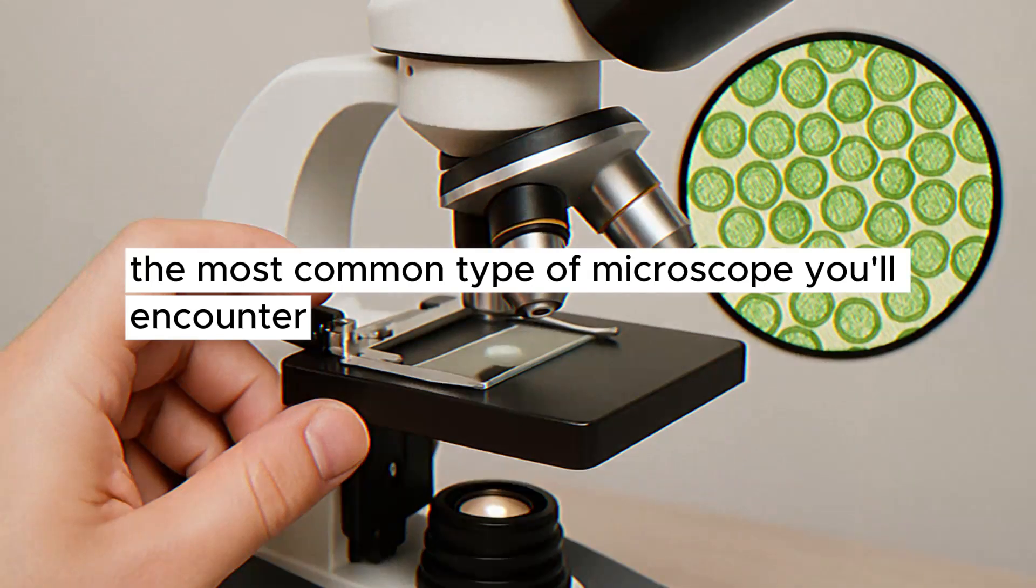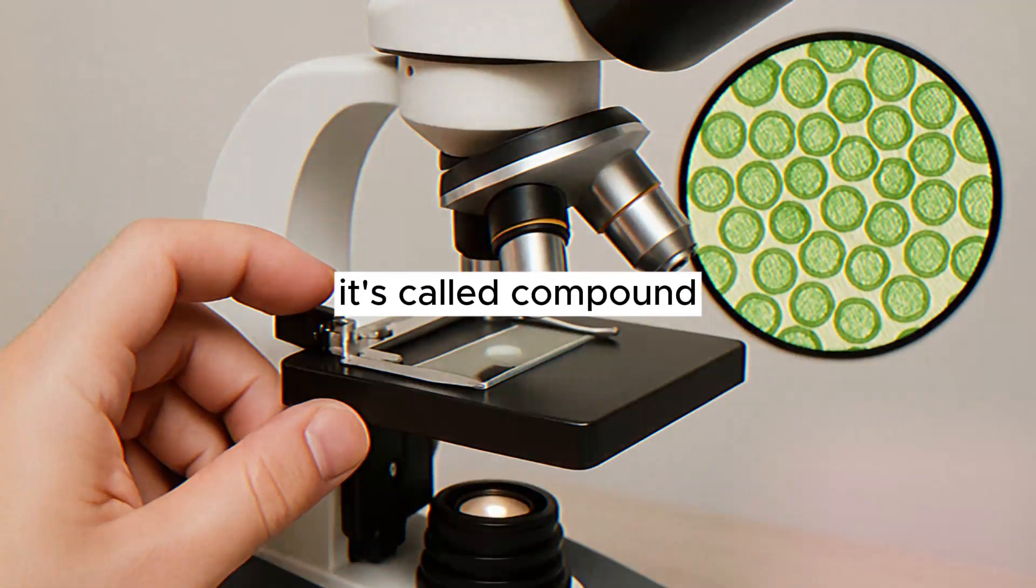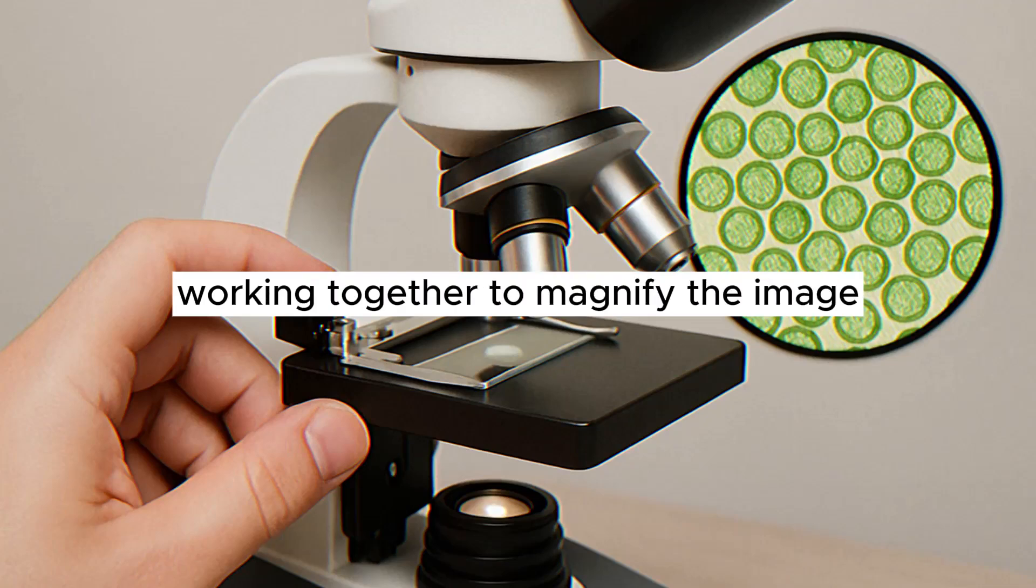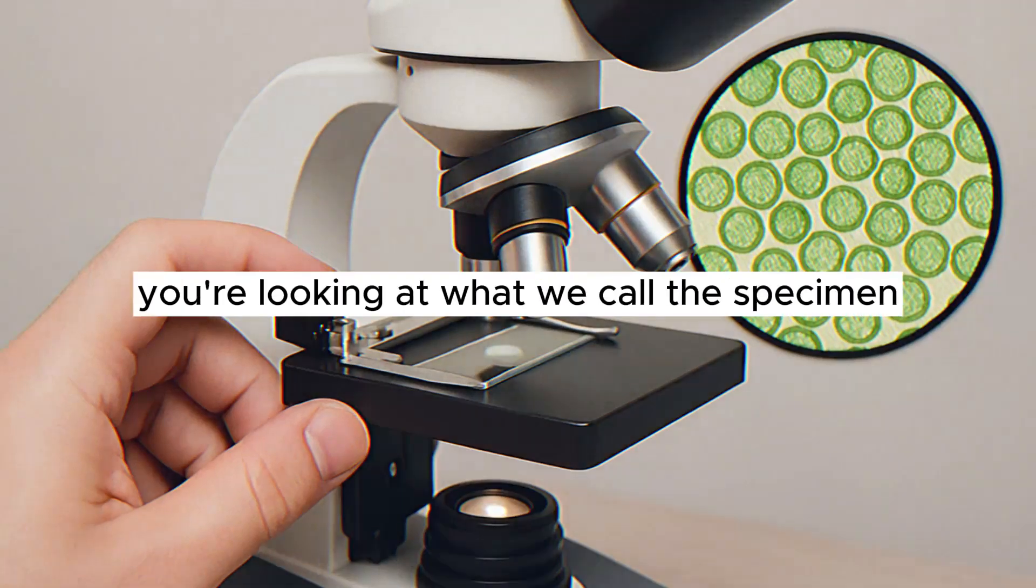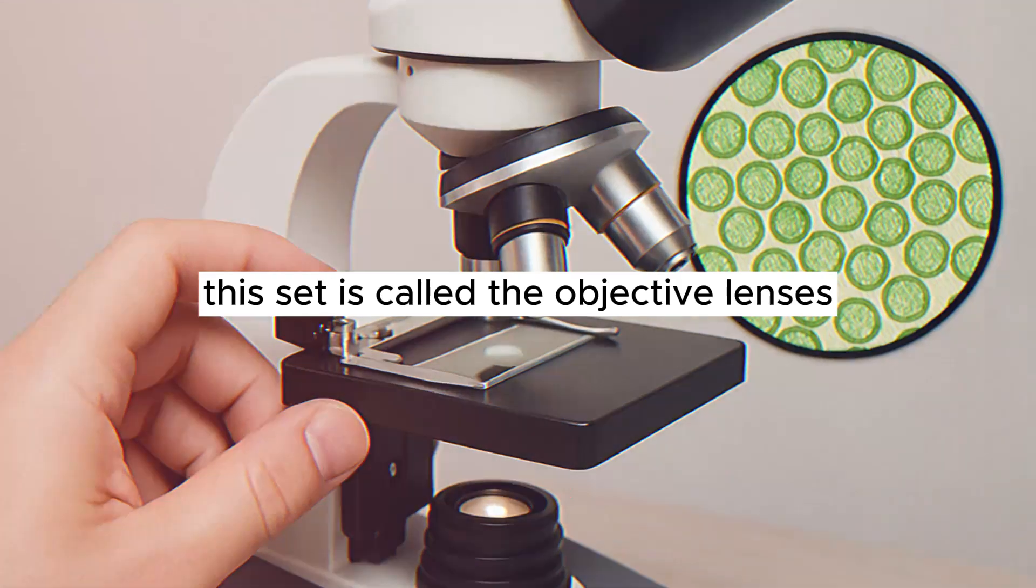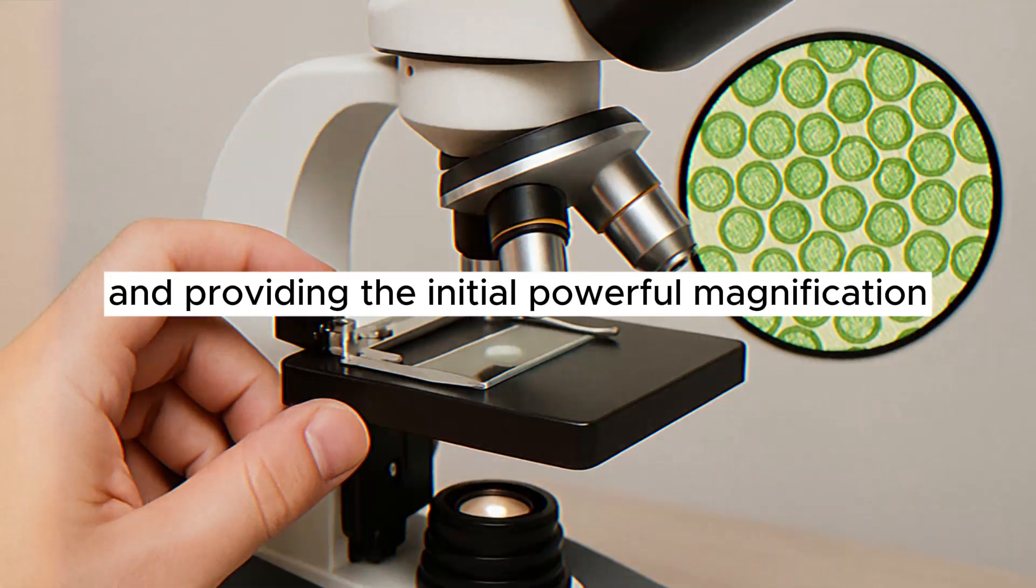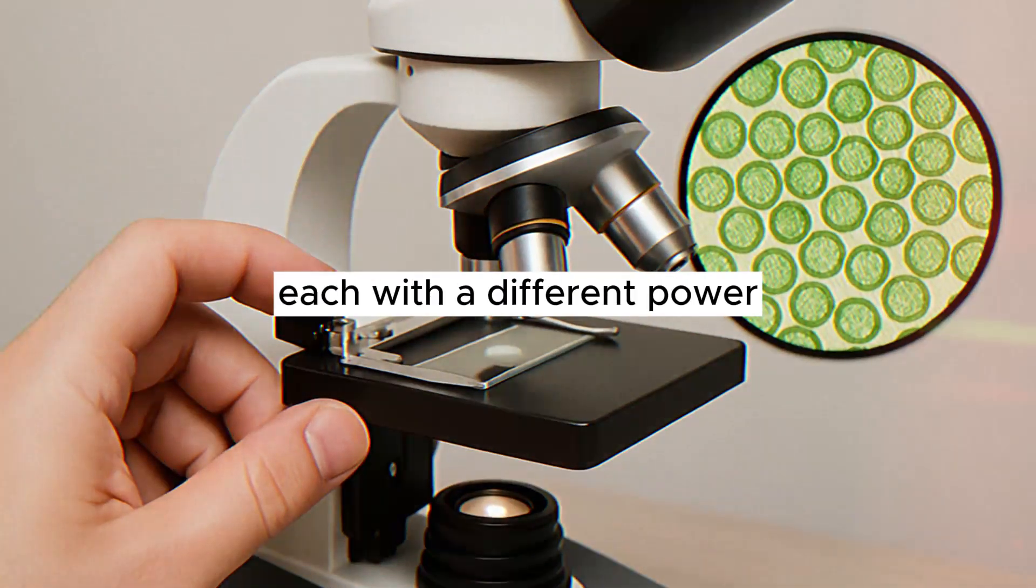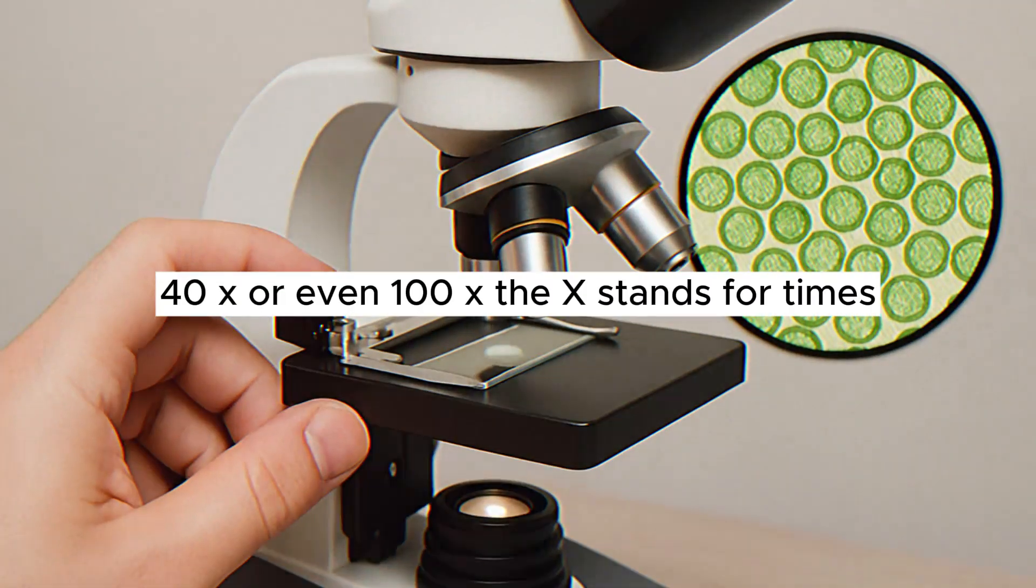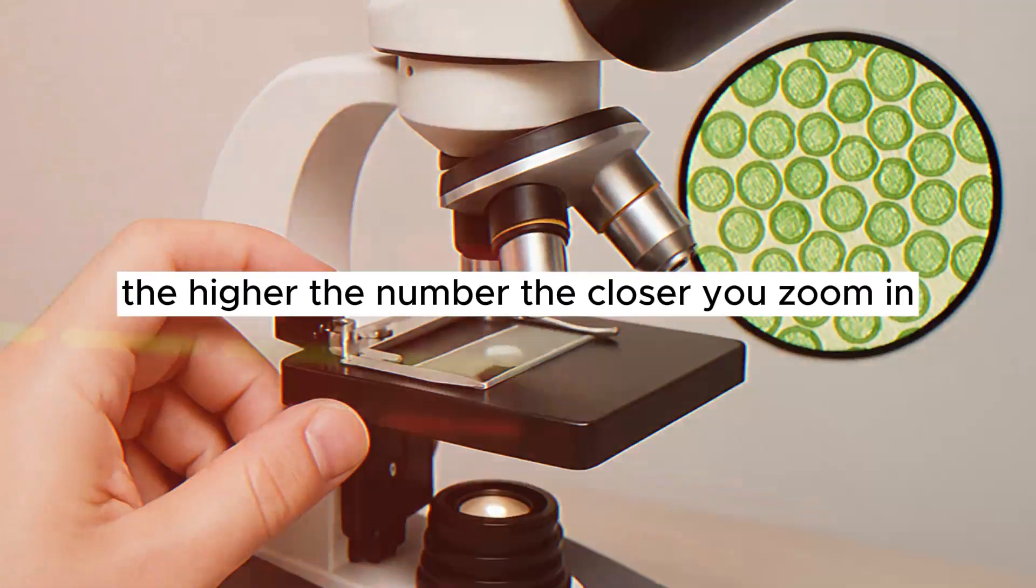The most common type of microscope you'll encounter, especially in schools or starting out, is called a compound light microscope. It's called compound because it uses two sets of lenses working together to magnify the image. The first set of lenses is really close to the tiny thing you're looking at, what we call the specimen. This set is called the objective lenses. These are the ones that do the heavy lifting of gathering the light and providing the initial powerful magnification. You usually have several objective lenses mounted on a rotating turret, each with a different power, like 4x, 10x, 40x, or even 100x. The x stands for times, so a 10x lens makes the object look 10 times bigger than its actual size. The higher the number, the closer you zoom in.